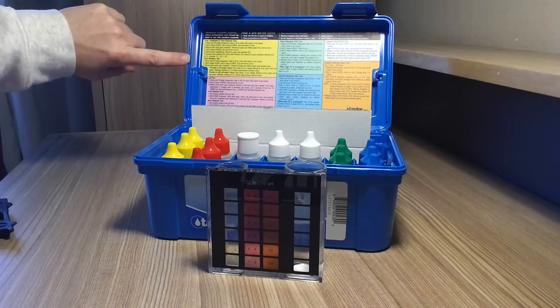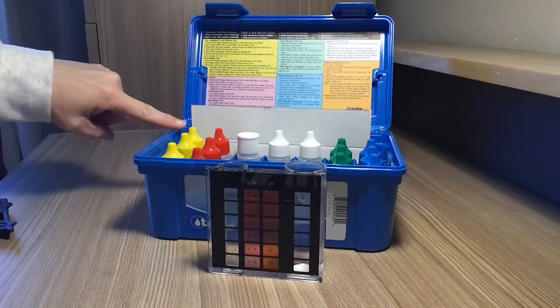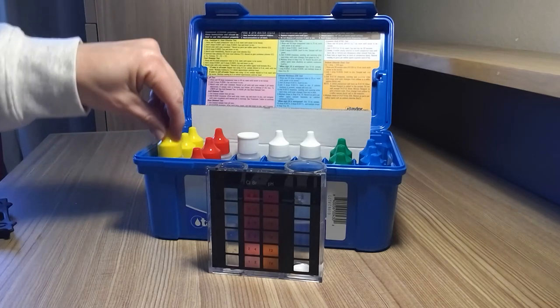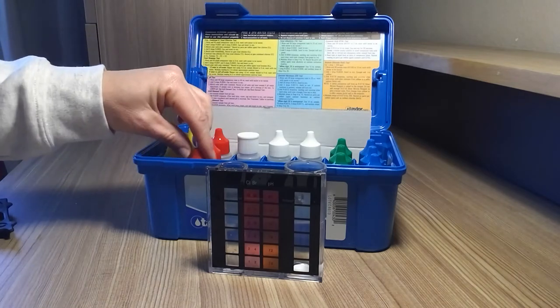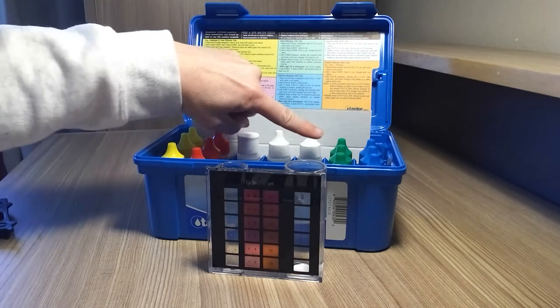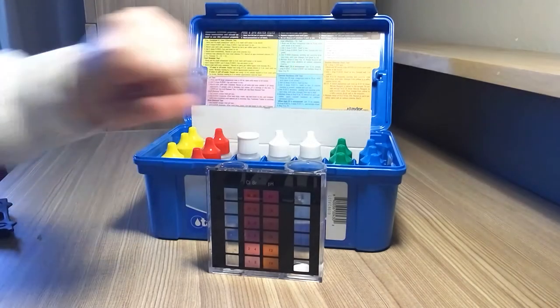Inside the lid of the Taylor test kit are all of the tests that you will be doing. Your total bromine, which is yellow — these will be the yellow dyes that you'll use. Your pH testing, which is in red. These are the ones you'll use for that. Green is your alkalinity, and for calcium hardness you'll use the blue.